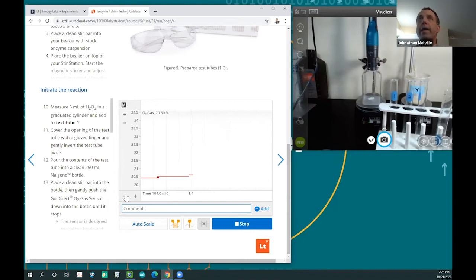And this reaction will last for, normally do this first reaction for around 200 seconds, so 3 minutes and 20 seconds. If you're ever doing this experiment, it's really important to proof the yeast or to proof your enzyme to make sure that you get a nice response.